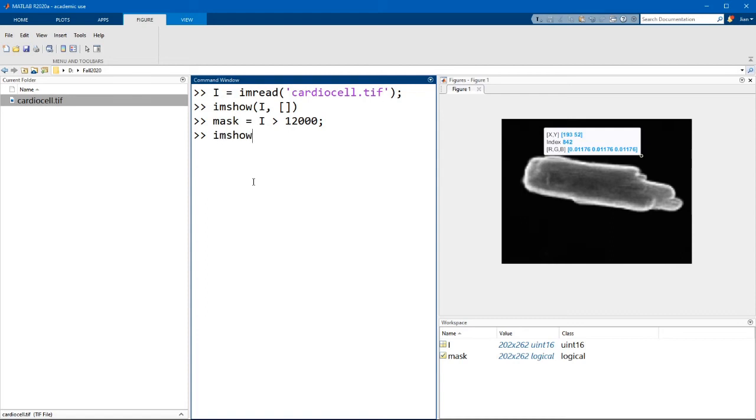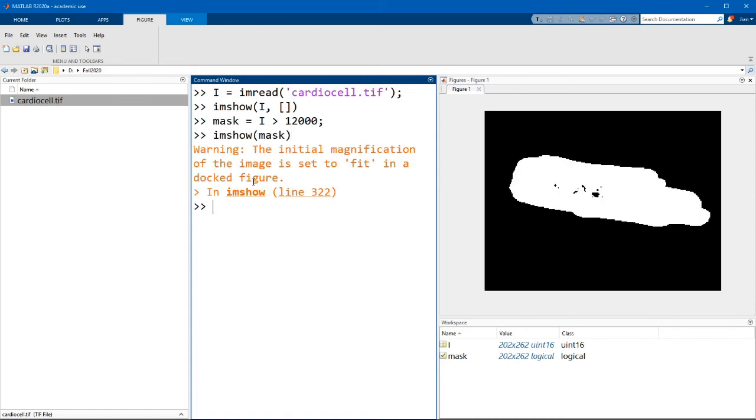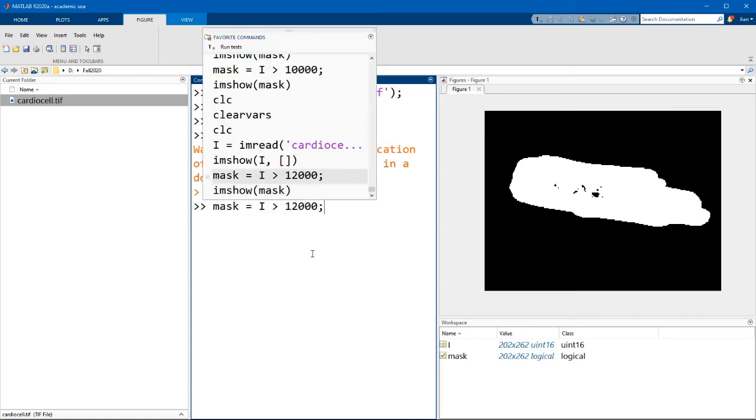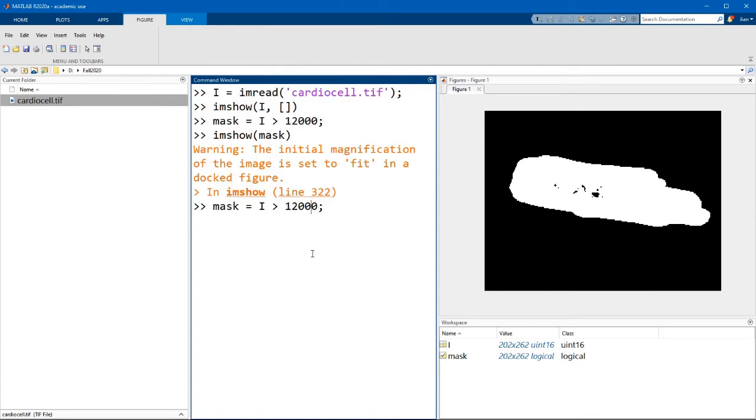Now if I display the mask, you can see that I have done a decent job of picking that first threshold intensity. However, I've missed a few pixels in the middle of the cell which are dim. So in this case, let's adjust the threshold intensity a little bit.